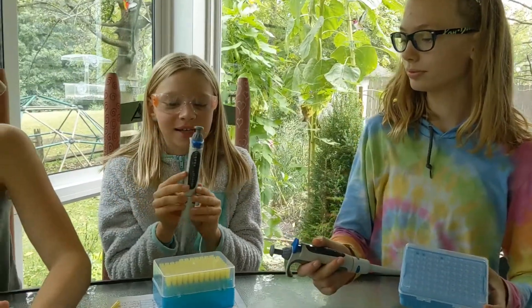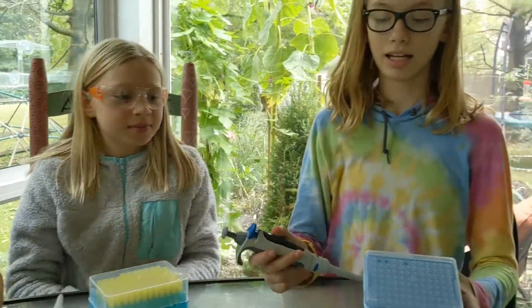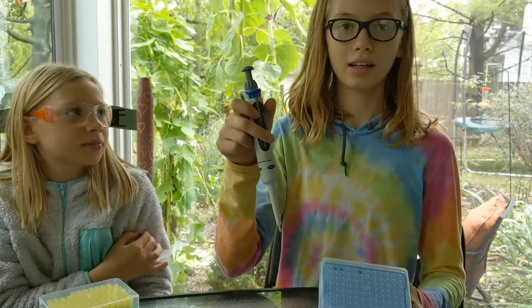So what you're going to need is a 20 to 200 micropipette and its tips, and a 0.5 to 10 micropipette with tips.